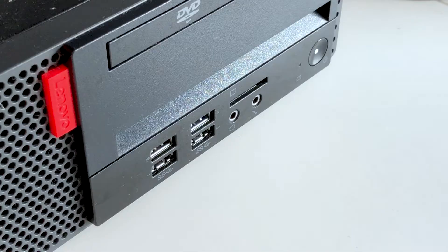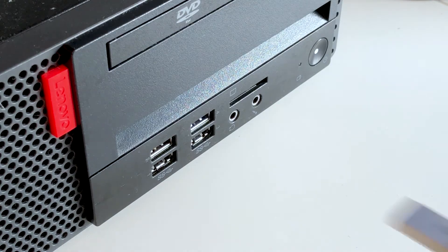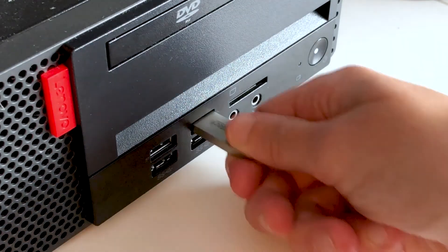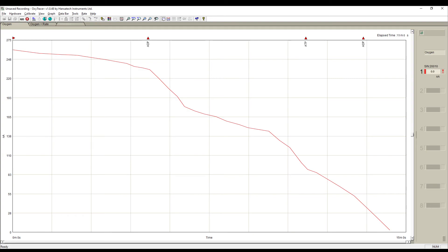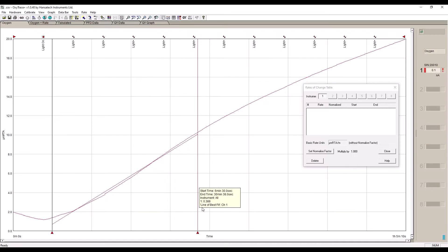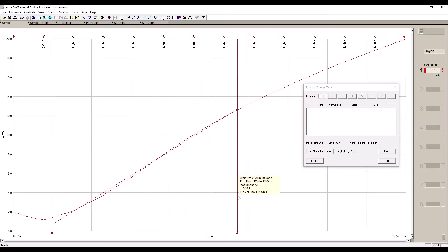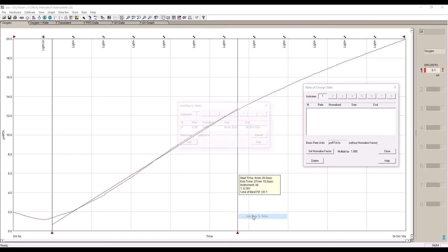For both versions, the bespoke Oxytrace Plus software manages configuration, calibration and real-time data acquisition for all connected Oxytherm Plus systems. Up to eight units can be connected to a single PC, allowing high sample throughput.